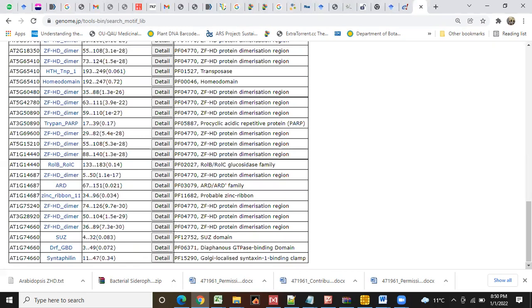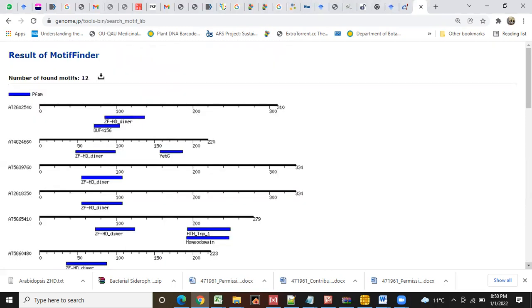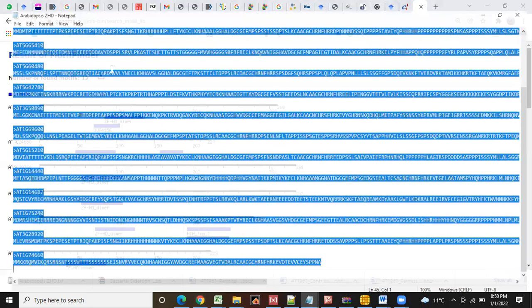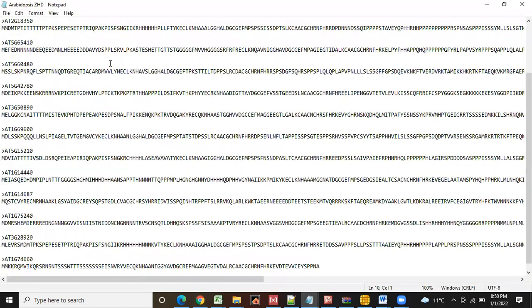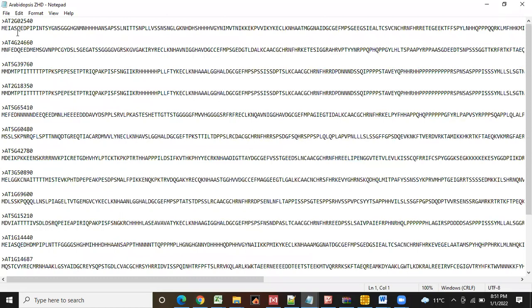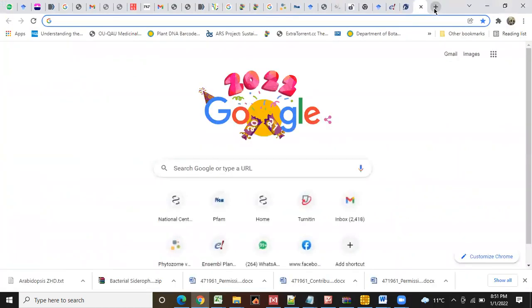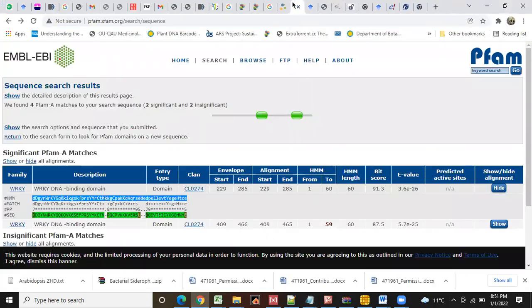So now there is a need to find out the ZFHD domain sequence. For that purpose, we will take any sequence and then we open this in PFAM.